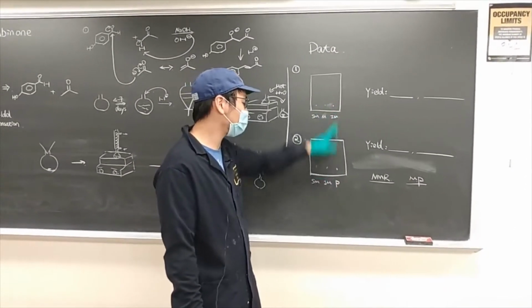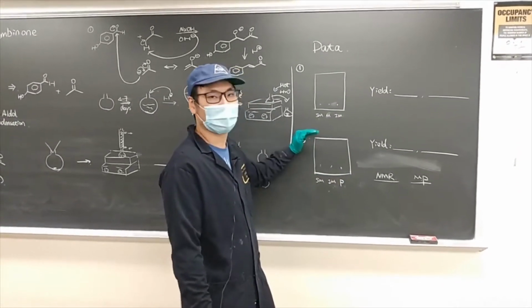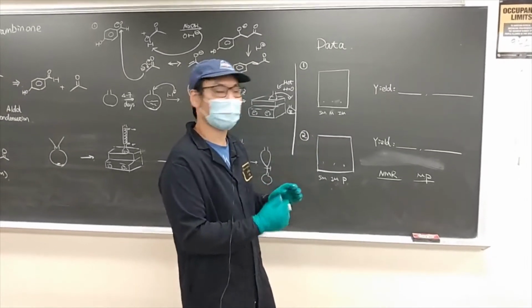It's the same from here. And also the final product, 3 spots, and let them go. And you can clearly see they are different materials. They have a different Rf value.